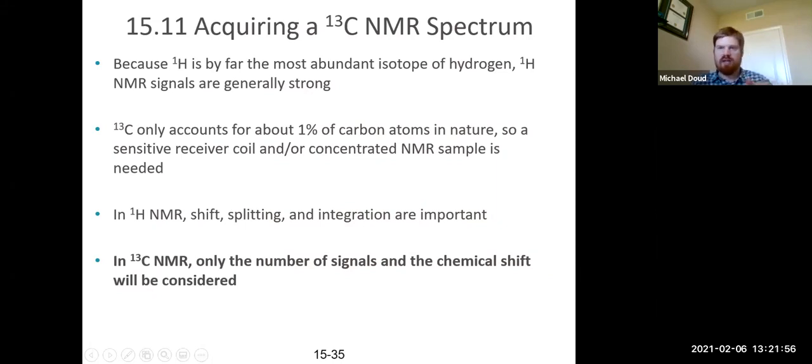That was proton NMR. Now the last thing that we want to learn about is carbon NMR. I know you're going over this in your lecture as well if you're taking the lecture at City College, but we want to talk about it here just very briefly because we are going to analyze them in this class. When you take a carbon-13 NMR, the signal that you're going to get is much, much weaker than what you get from a proton NMR.